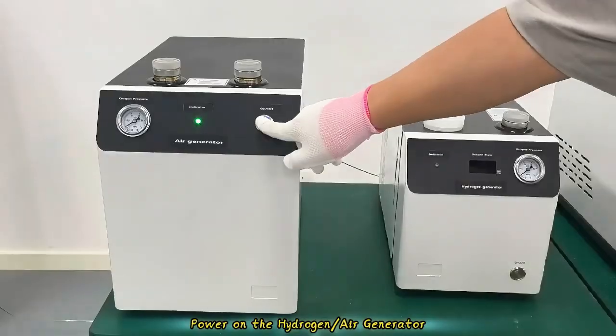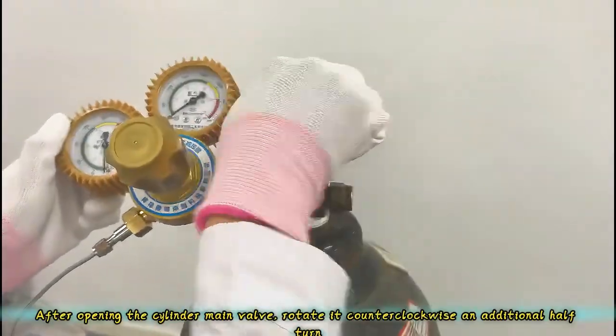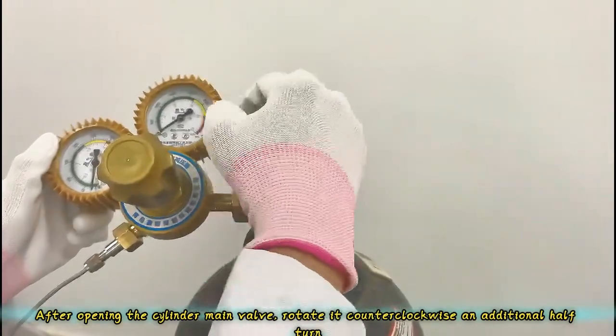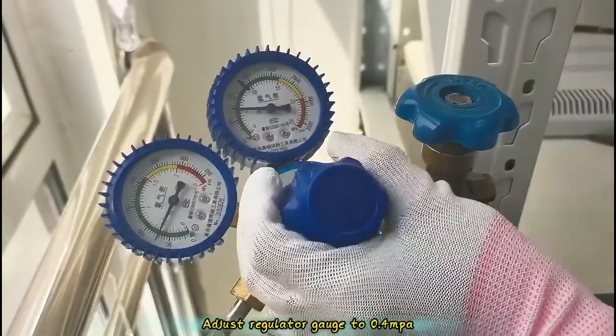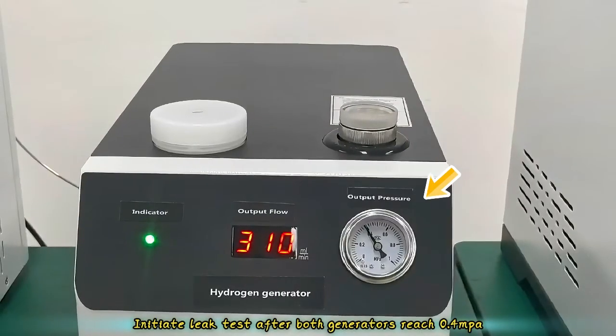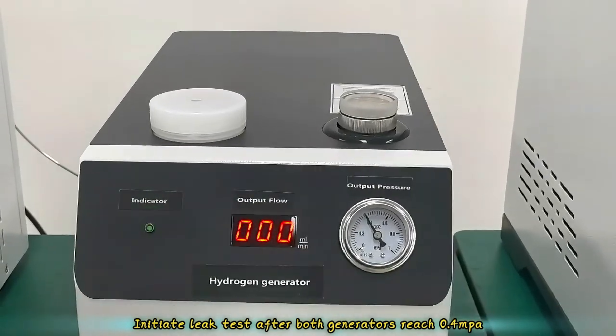Power on the hydrogen air generator. Open main valve of nitrogen cylinder. After opening the cylinder main valve, rotate it counterclockwise an additional half turn. Adjust regulator gauge to 0.4 MPa. Initiate leak test after both generators reach 0.4 MPa.